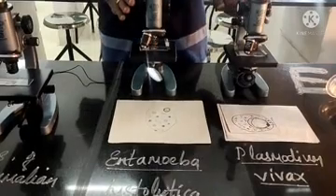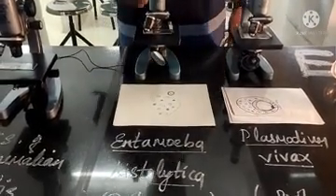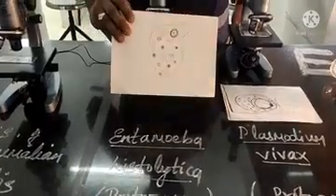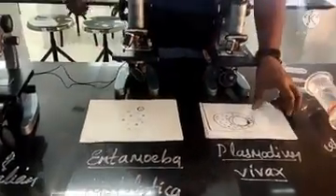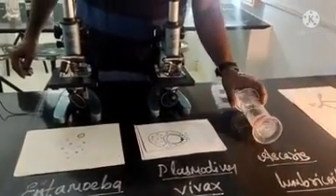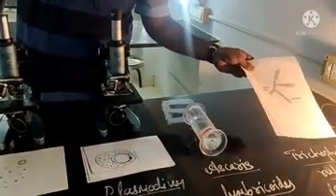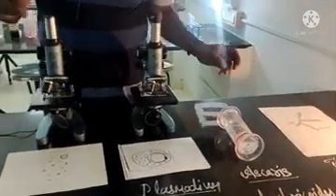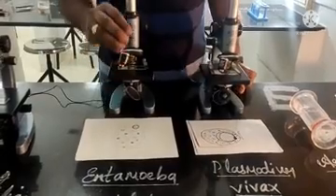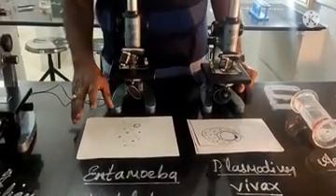For this E, in the regular practical classes, we have shown Entamoeba histolytica photograph, then Plasmodium vivax photographs, Ascaris lumbricoides specimen, then Trichophyton rubrum. This is the photograph. So E question: identify the name of the pathogen and name the disease it causes.